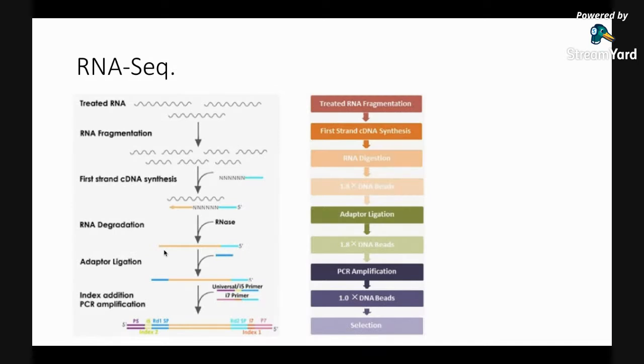So we'll start today with the mapping of data from RNA-seq. So you have given your samples for RNA sequencing. They go into a machine. Yeah, most of the people don't really see it, right? And then you get a big file back, like a few GB file back, right? Then what do you do with that big file? Most of the time, you ask somebody to give you counts data, not the raw data, right? But today we will deal with raw data, right?